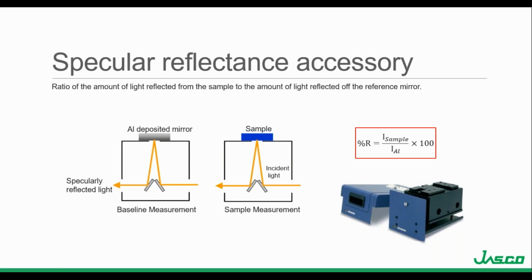In this accessory, the baseline measurements are acquired by placing an aluminum mirror on both the reference and sample stages, and then the mirror on the sample stage is swapped with the sample itself to acquire the sample measure.